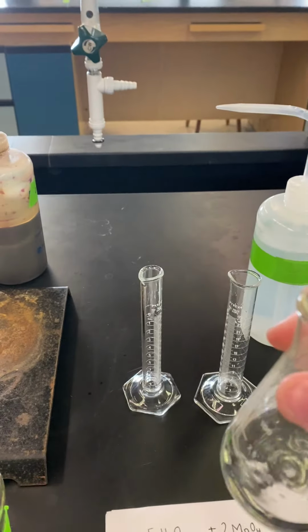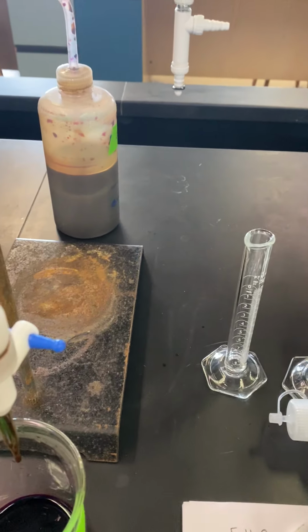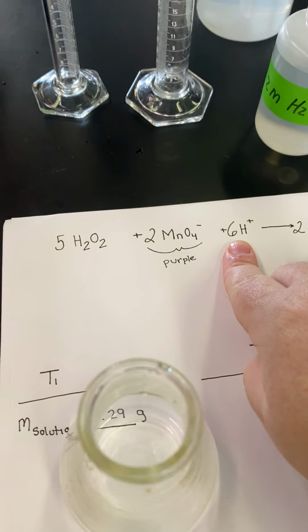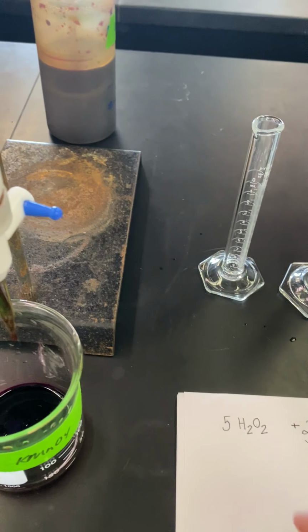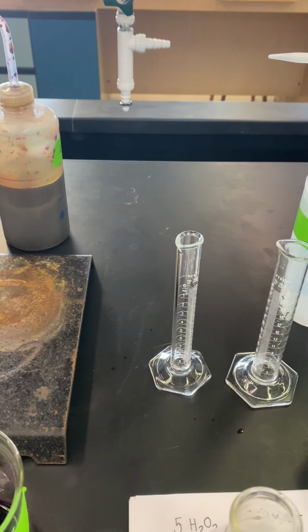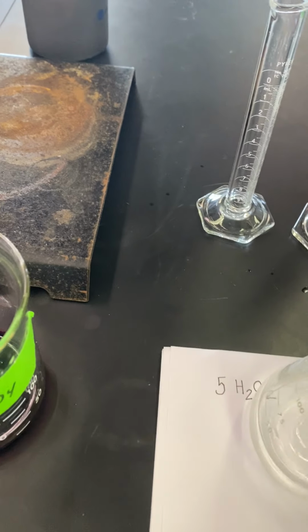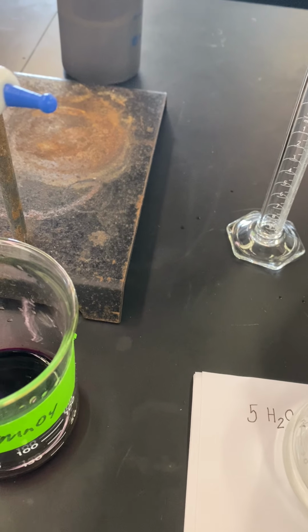Also in this flask, we need to add that sulfuric acid. Part of this reaction, guys, is that we need protons. So if we do not add the sulfuric acid, the reaction will not take place and your purple color will persist and you will never get the reaction to do what it's supposed to do. So we have to make sure that we add the sulfuric acid.